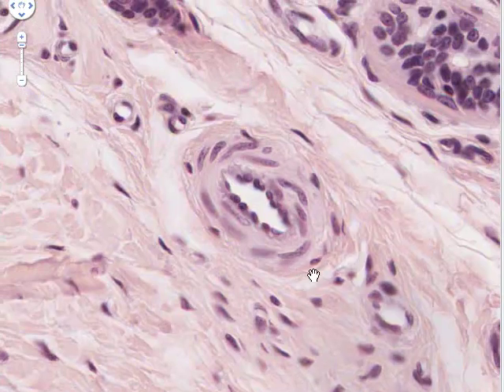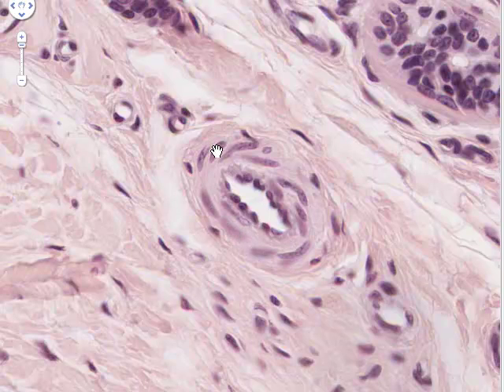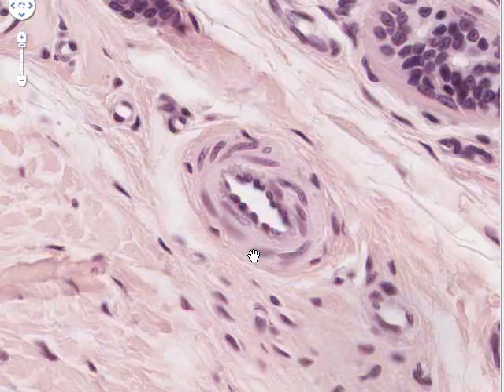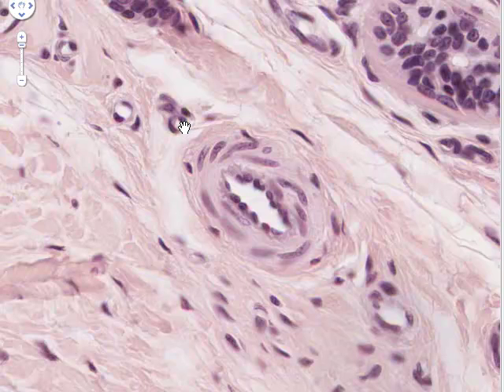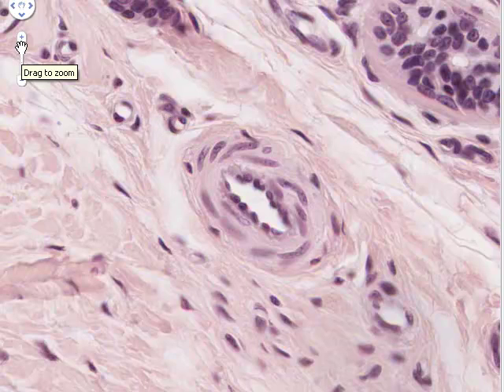Here's an arteriole — we've seen one before. You can see the nuclei of the squamous endothelial cells projecting into the lumen, which has contracted due to the elasticity of its wall. Outside the endothelium are smooth muscle cells oriented circularly around the wall. Close by are two or three smaller blood vessels — these are capillaries. We can see the nuclei of capillary endothelial cells, which either bulge into the lumen or are wrapped closely around it.